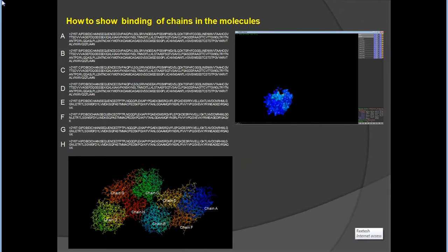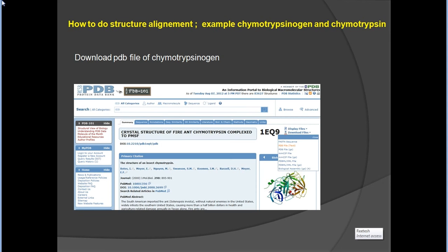For secondary structure selection, type 'ss helix' to select helices and related elements. If you would like to show binding between chains in the molecule — to know which chain binds with which chain — just go step by step and get information about the chain interactions.